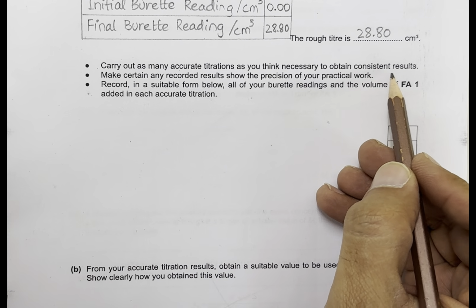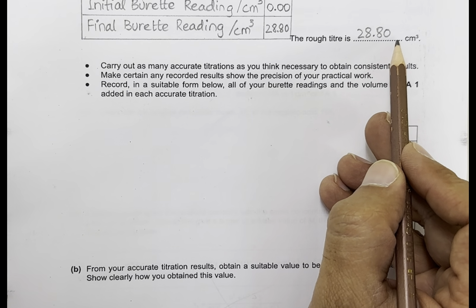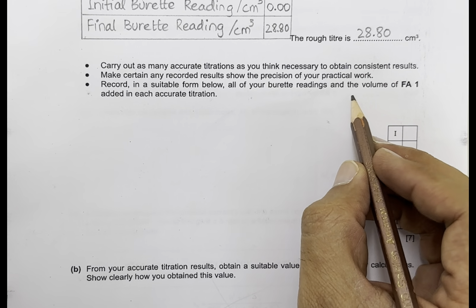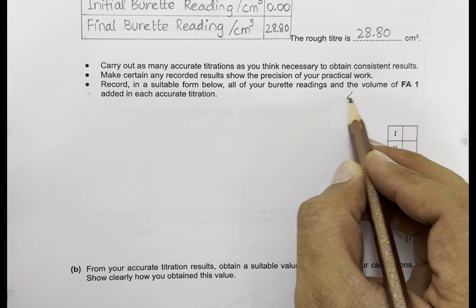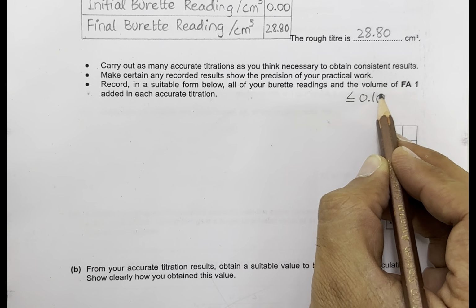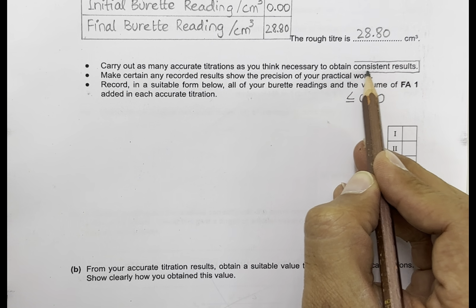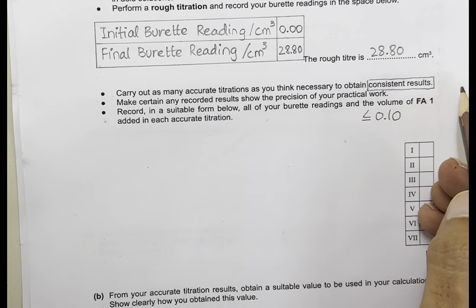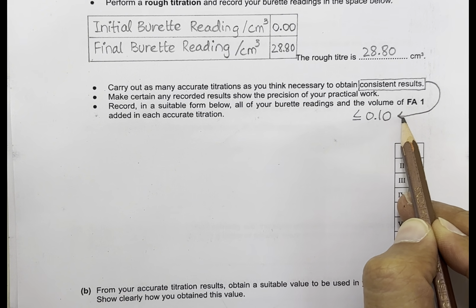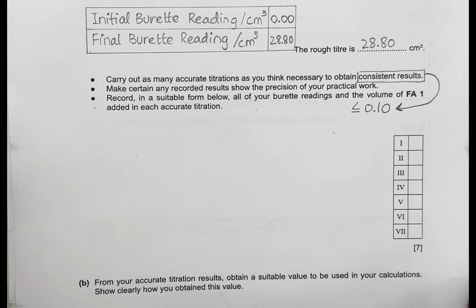Consistent results means the volume of titer used must be within 0.1, means it should be equal to or less than 0.10 apart from each other. Consistent result means 2 volumes used which are not more than 0.1 far away from each other.